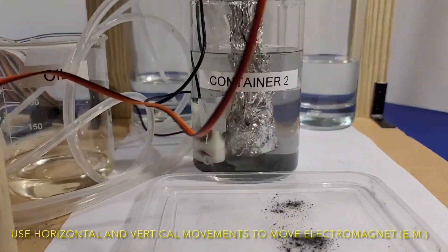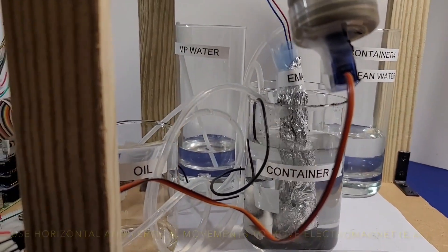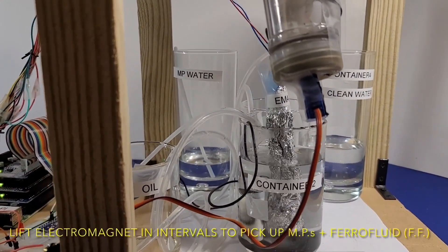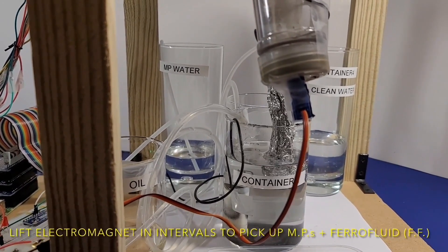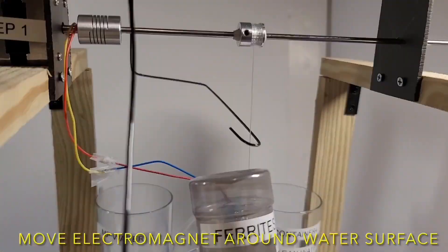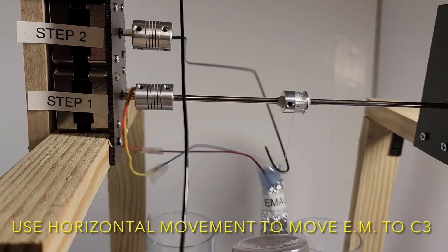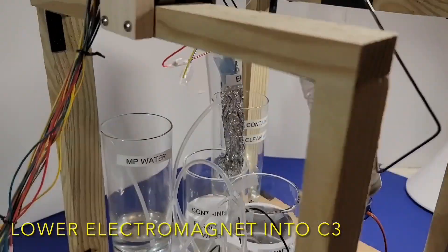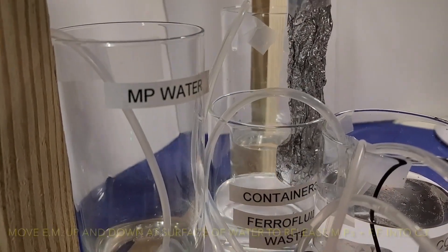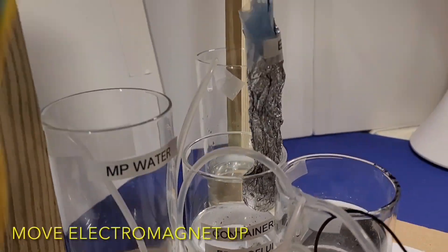Using horizontal and vertical movements, the electromagnet is moved up and down. The electromagnet is then lifted up in intervals to pick up ferrofluids with attached microplastics. The electromagnet then skims the surface of the water. Now it is lifted up and horizontally moved to container 3, where it is lowered in. The electromagnet is then turned off, which releases the ferrofluid waste into the container.